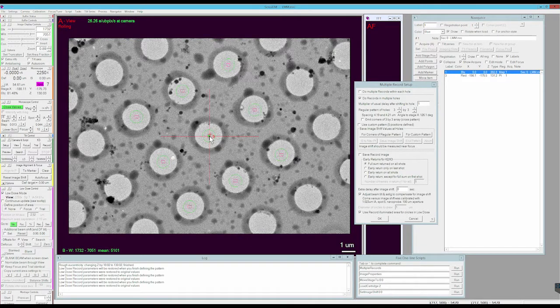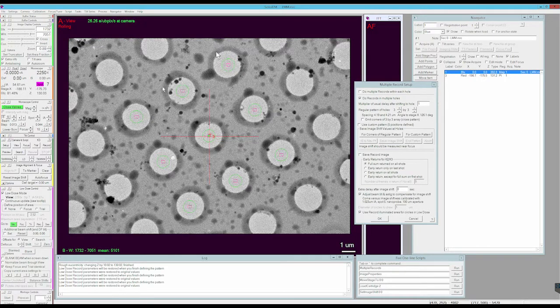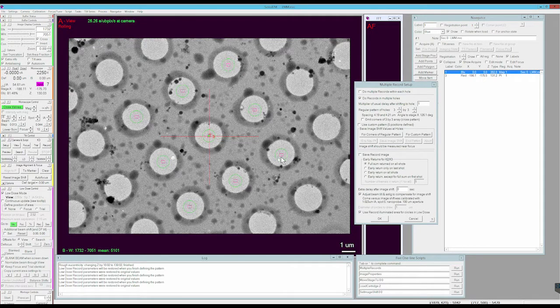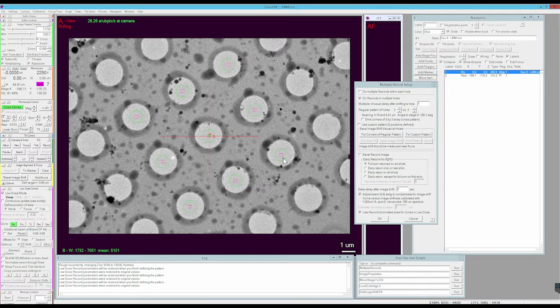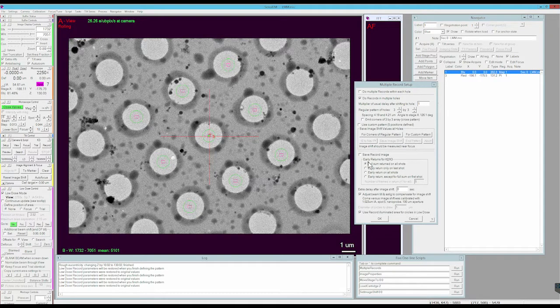Now clicking on the crosshairs, you can see my hole pattern, very nice. If you're doing one image per hole, this is where you would stop.